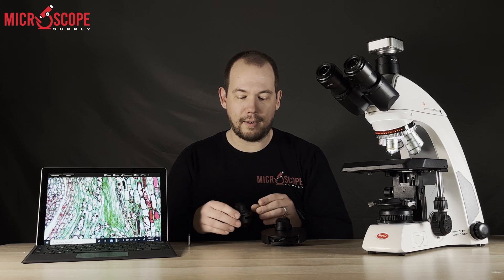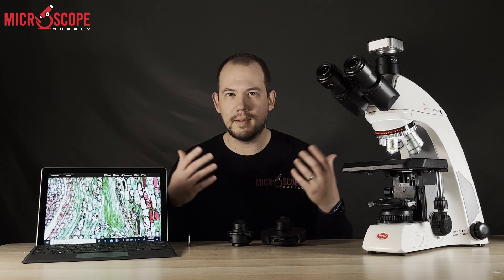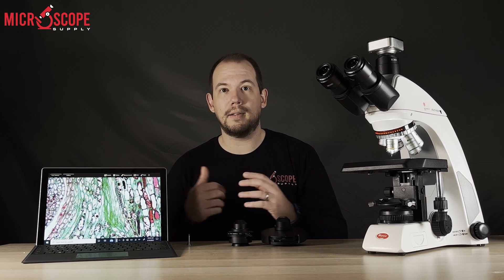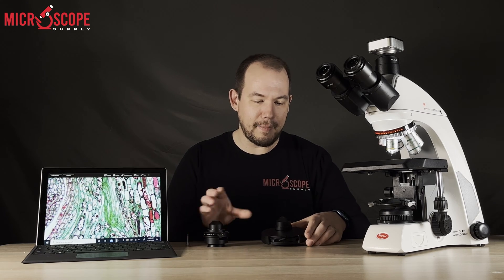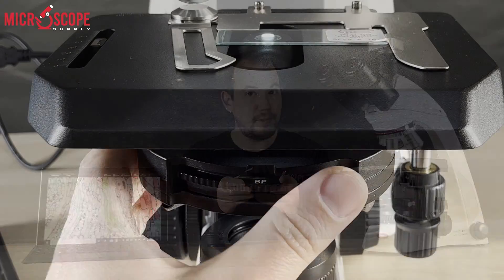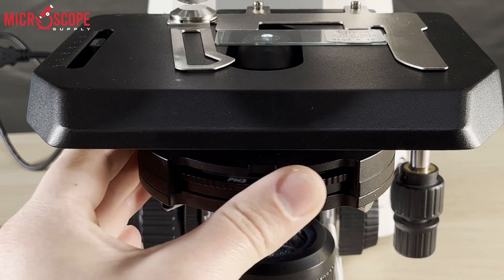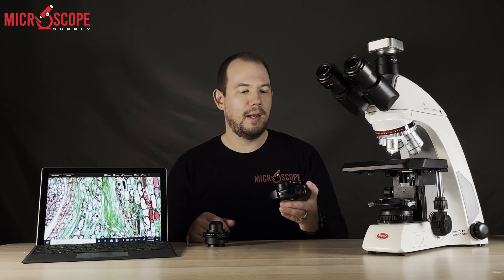The phase slider is a great option to save money if you're only using two objectives for phase. However, if you're looking to use a 10x, 20x, 40x, and 100x objective for phase — plus dark field and bright field positions — we recommend the phase turret condenser. This is really nice because it has Phase 1, Phase 2, and Phase 3, covering everything from 10x up to 100x, as well as a dark field stop and bright field position, making it very simple when bouncing between phase objectives.